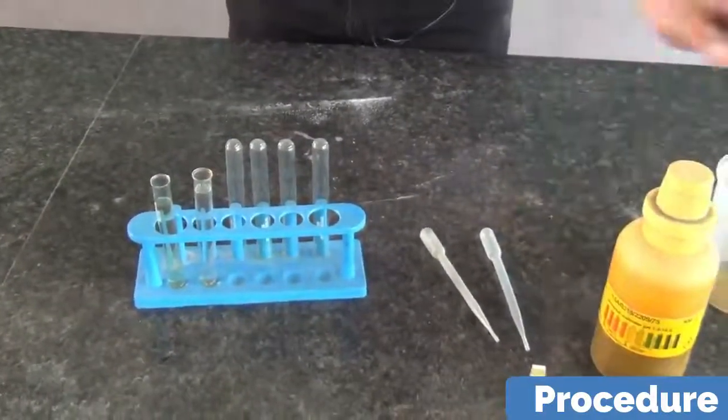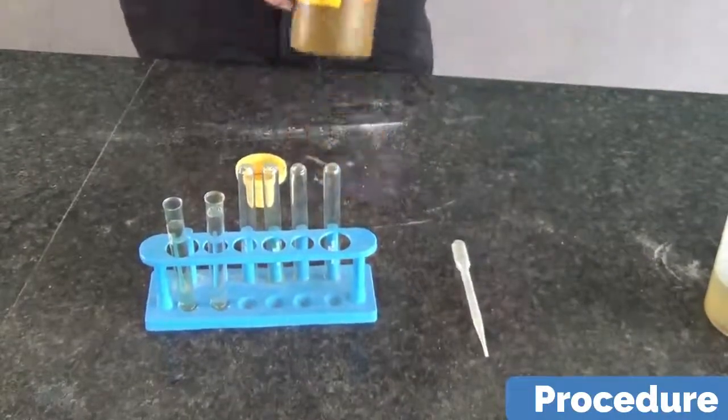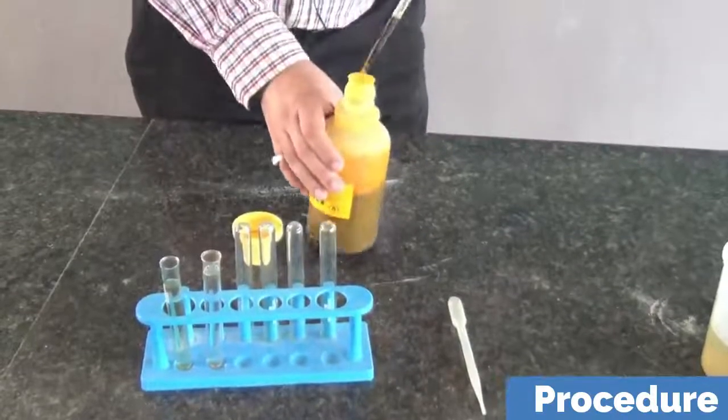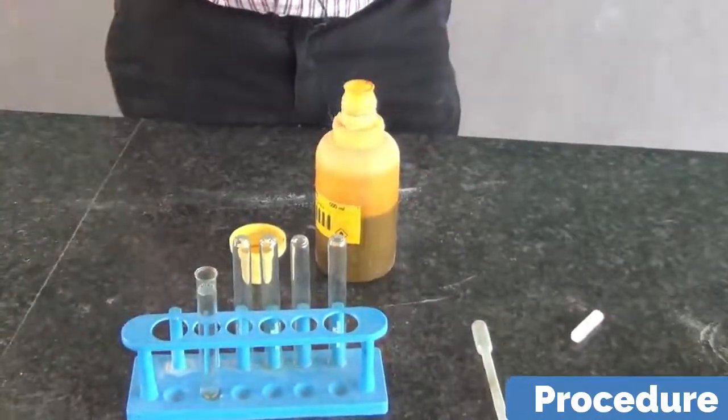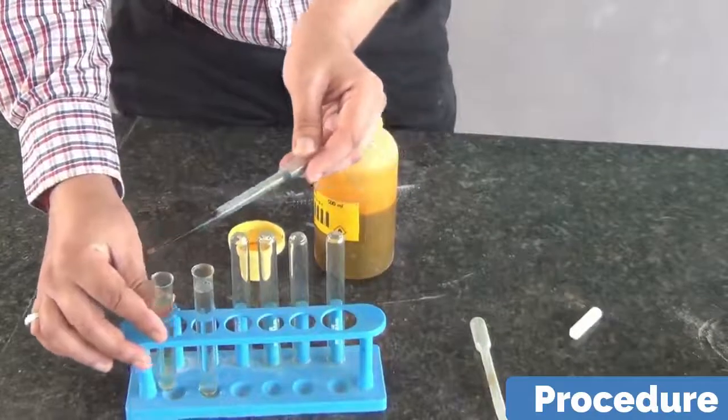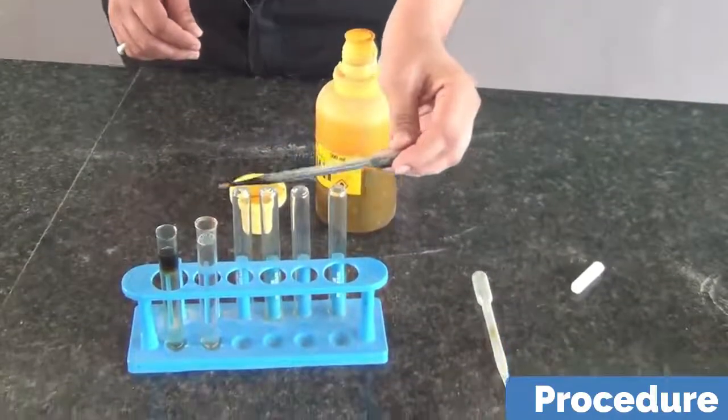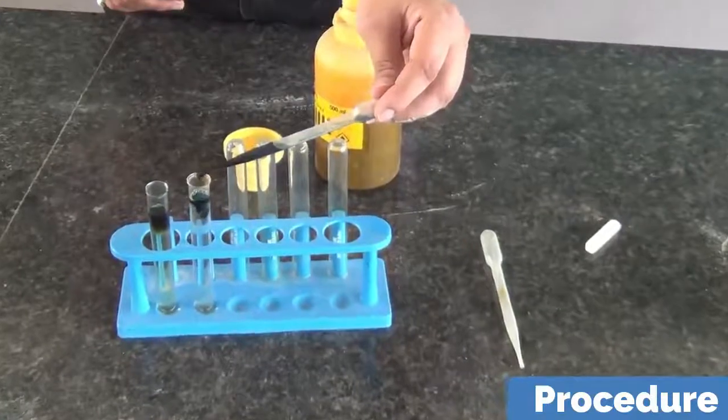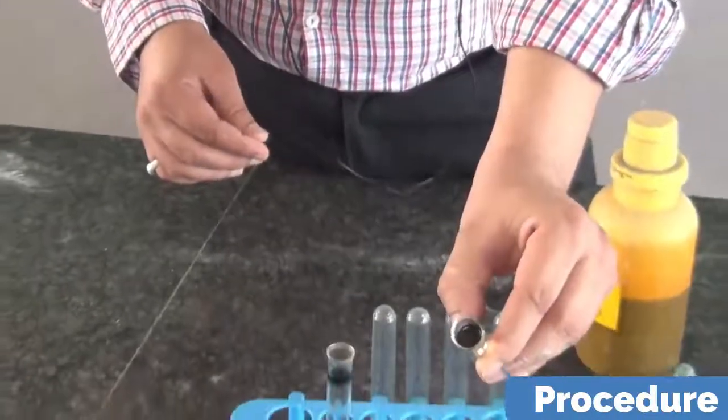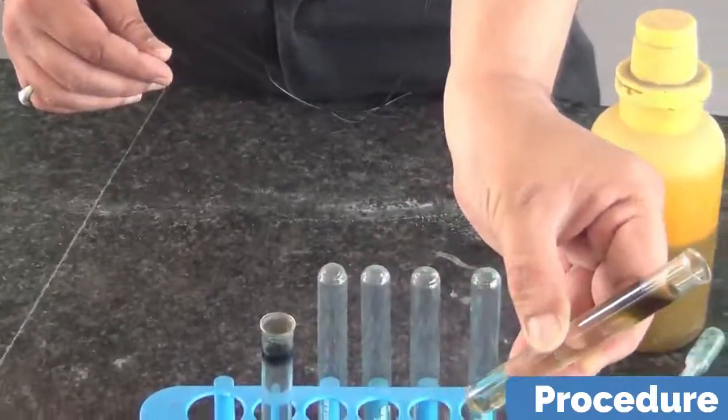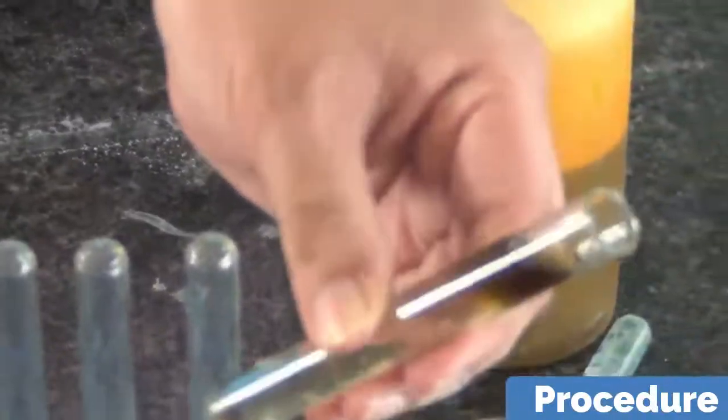Now I am going to add universal indicator solution to both of these and we will be observing the color. Just two or three drops are required. First to sample A, then to sample B. In the first case, just see inside the water in the test tube. Bluish green color at the side. You can see bluish green appearance. It is dark green. So dark green color.